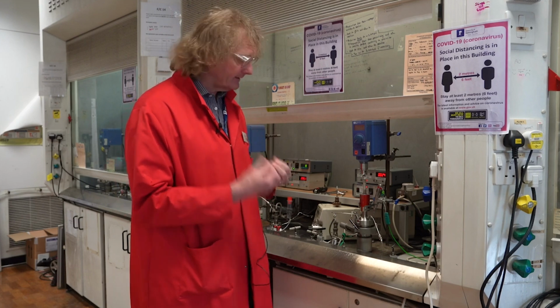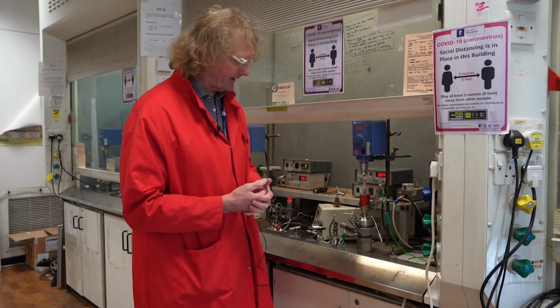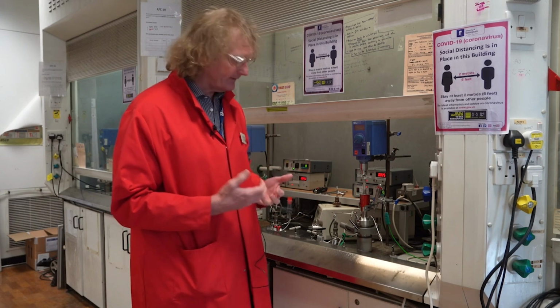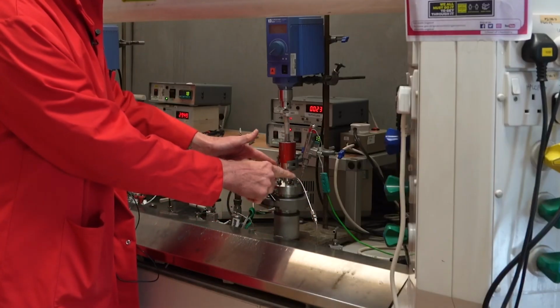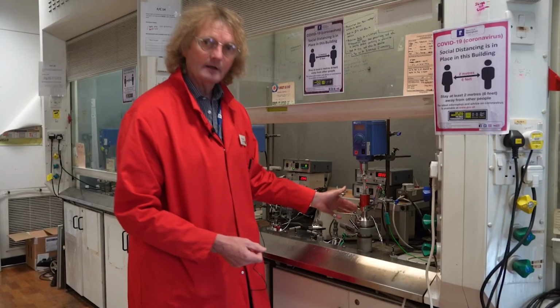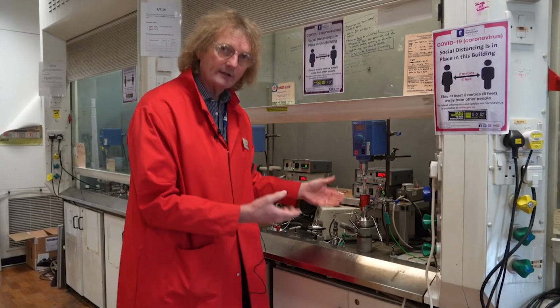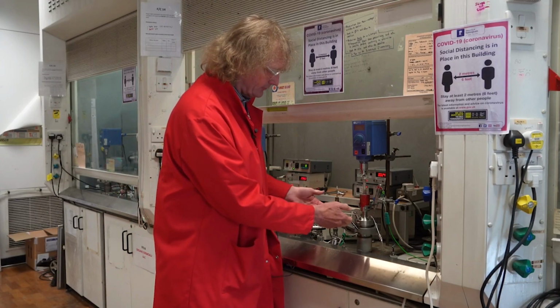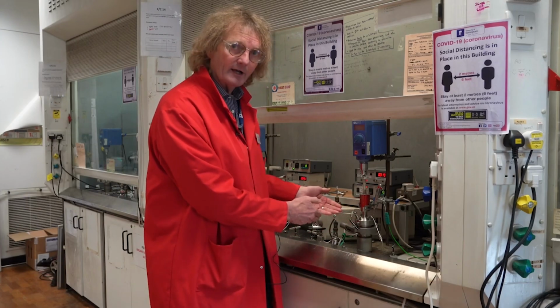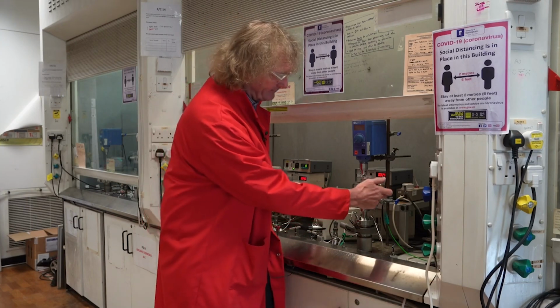And the other thing that the head unit allows us to bring in is all the things we need. So we've got pipes here that can allow us to add CO2, we can inject monomers, we can put in other gases, and we've got all the safety devices to allow us to ensure that we're measuring the pressure, and then we've got a safety blow-off valve here.